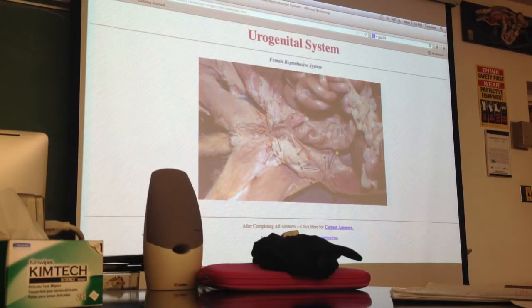So if that's the uterus, then if you pull this up, there's going to be a thin sheet attached to it on either side. That's going to be the broad ligament. It's going to look like a mesentery. If you look at the intestine right here, just to remind you what the mesentery looks like, it's that sheet-like structure that holds onto the organ. It's going to look a lot like that. Okay? You're not going to have the vessels. Sometimes you do have fat in it, but it's just going to look essentially like a mesentery attached to the uterus.